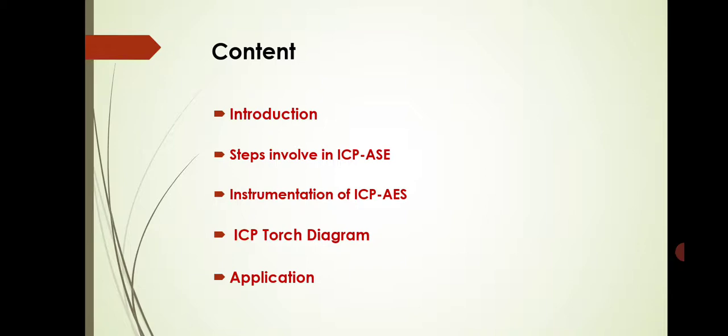Content: Introduction, steps involved in ICP-AES, instrumentation of ICP-AES, ICP torch, diagram, and applications.